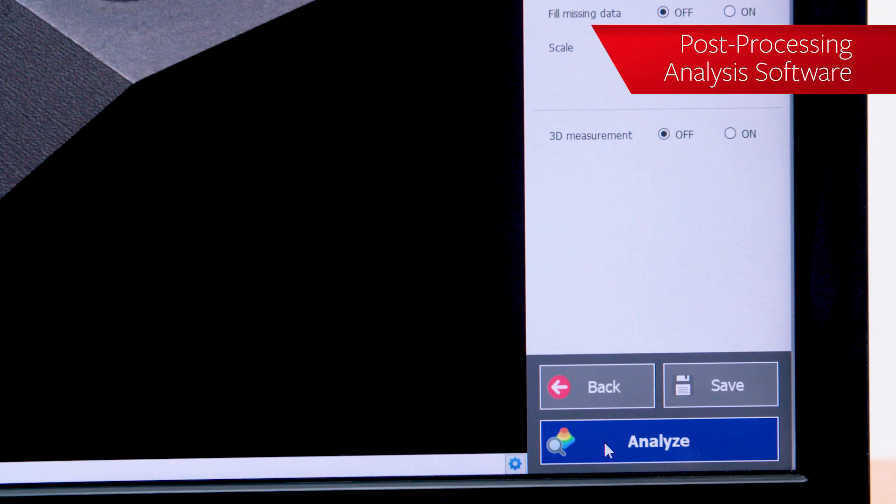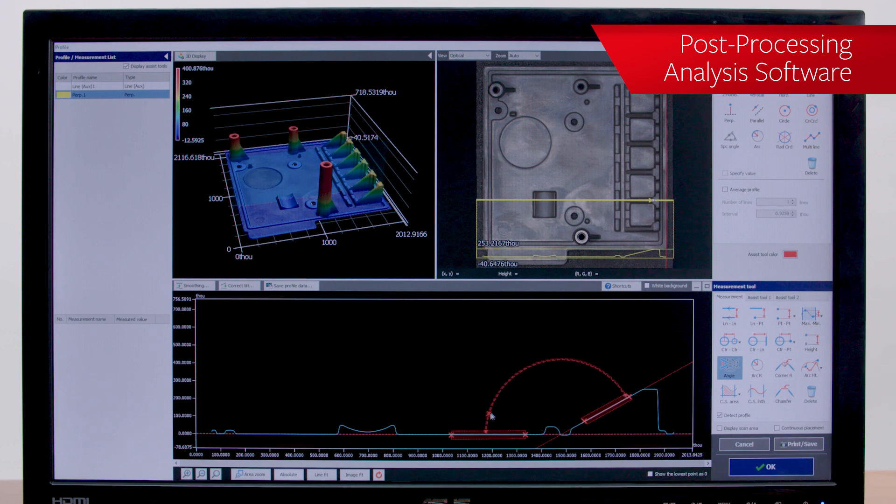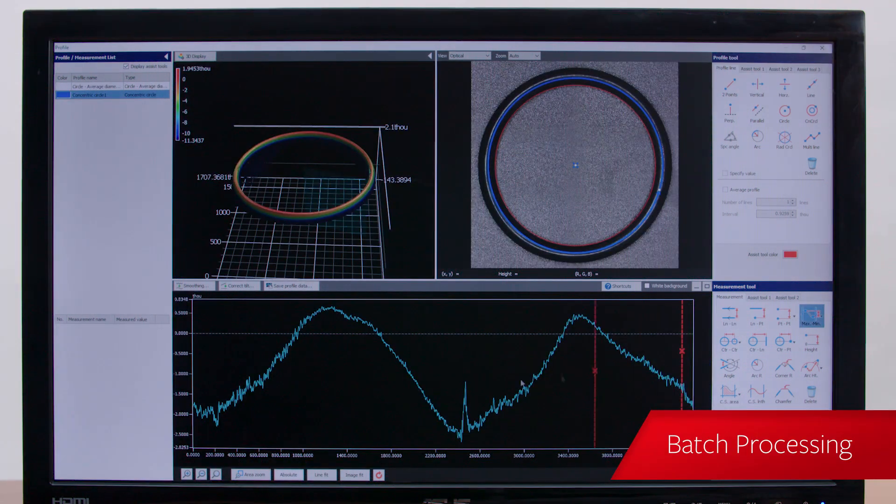The post-processing analysis software provides advanced measurement capabilities, making it easier to tie measurements to decision making. Batch processing promotes measurement across many parts, saving time and increasing repeatability.